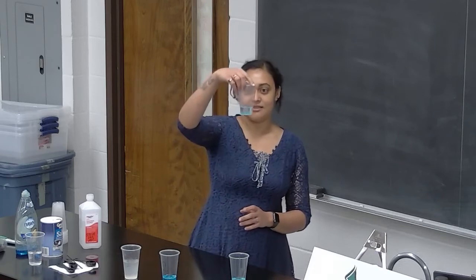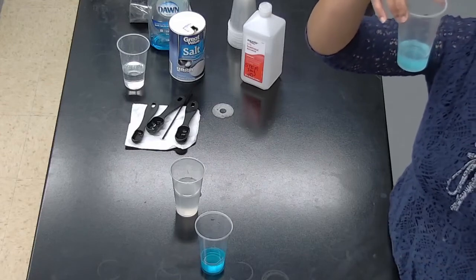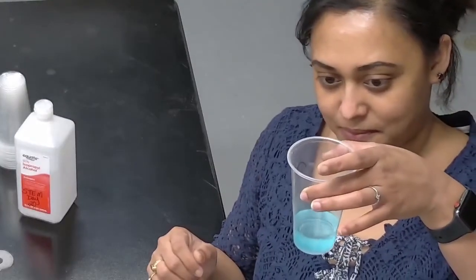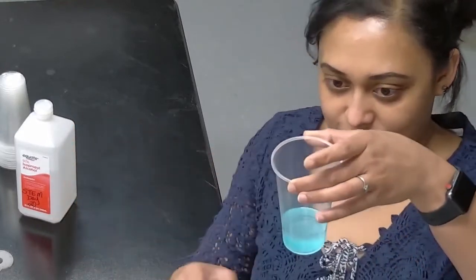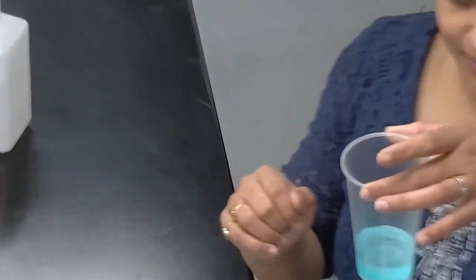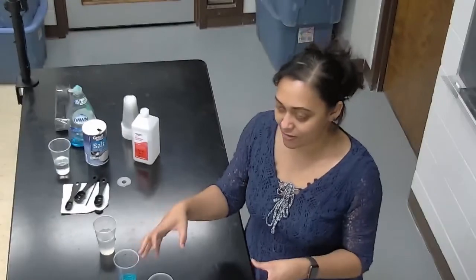We can see how clouds of DNA are accumulating here. I don't know how well you can see, but once you do it, you can definitely see it. There are tons of DNA. I'm sure you'll get very excited if you have an electron microscope. These are DNA clumped together. This is not a single strand of DNA.